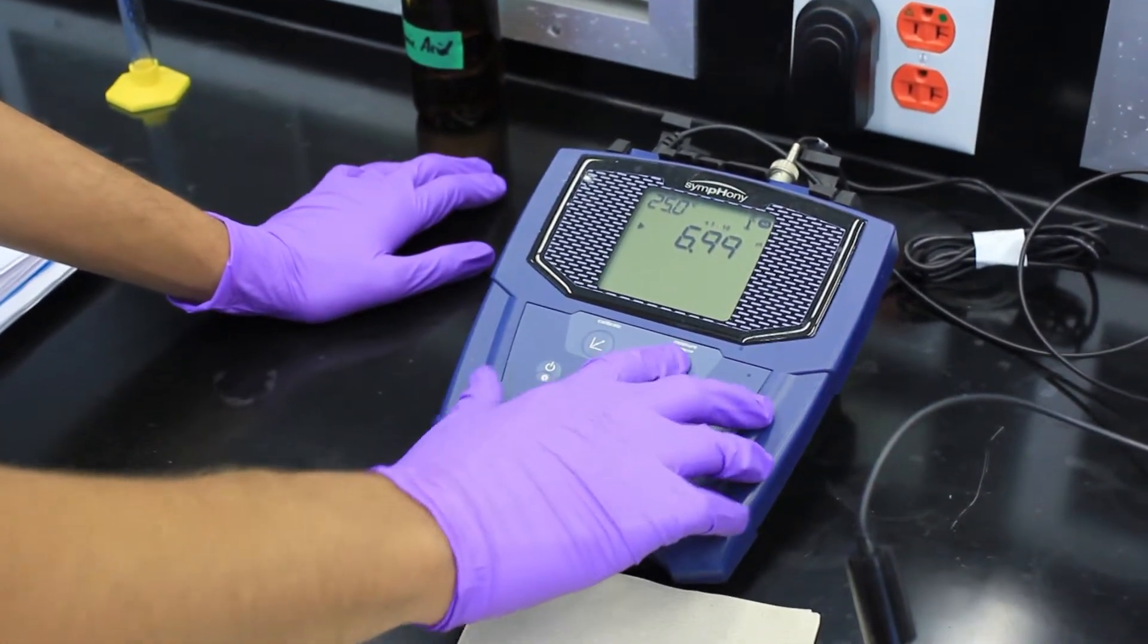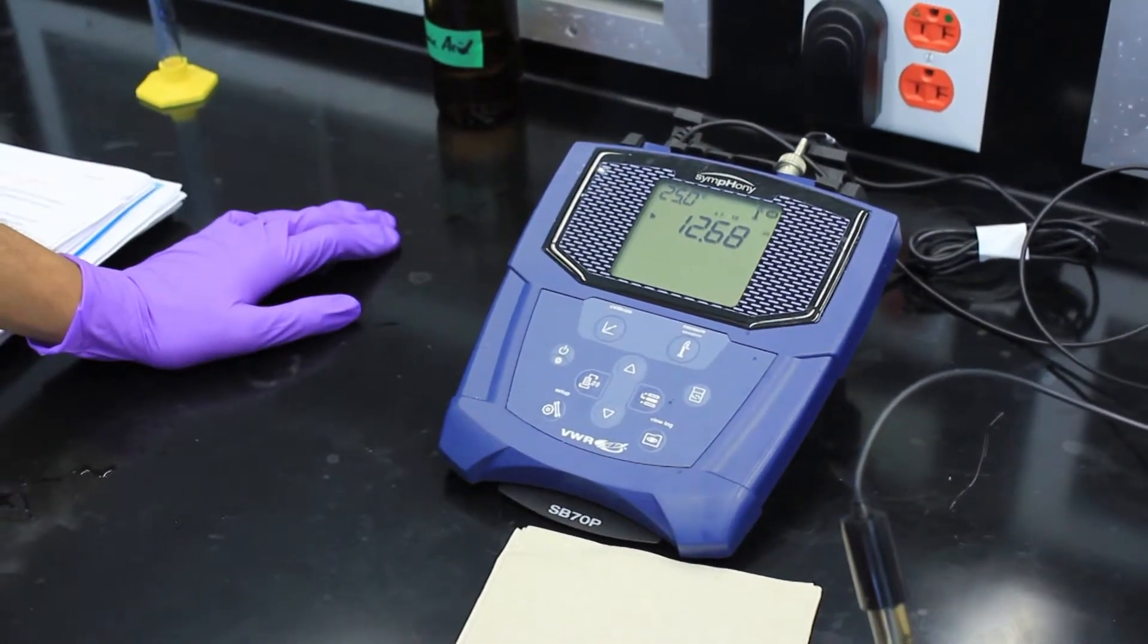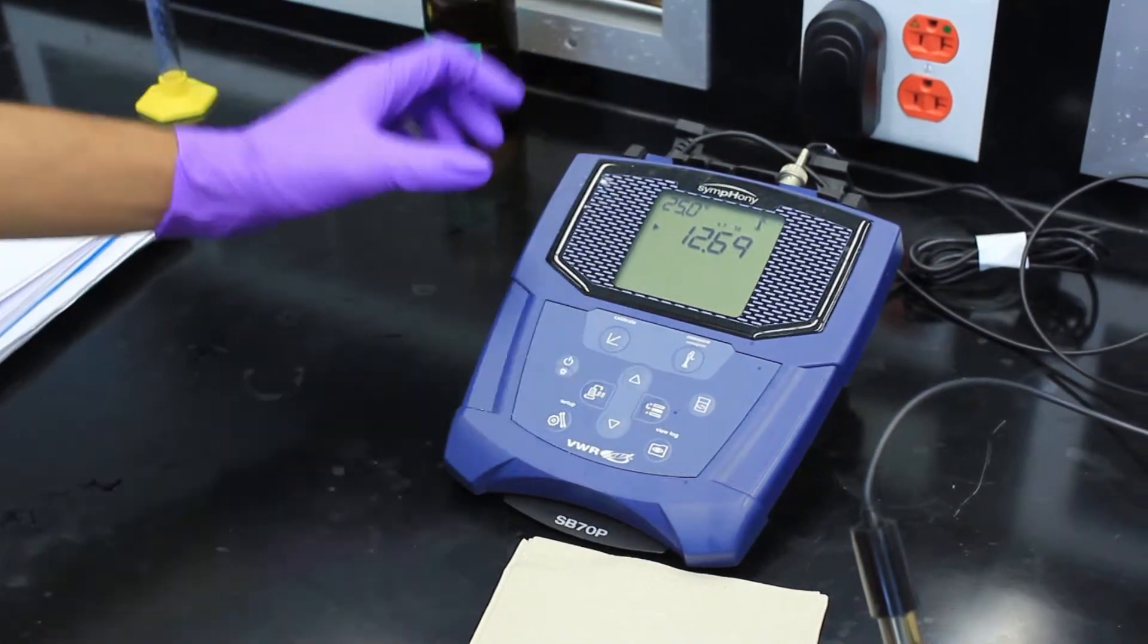You press measure and wait. Once the pH stabilizes, it will show you the actual pH, which will be the last number on the screen.